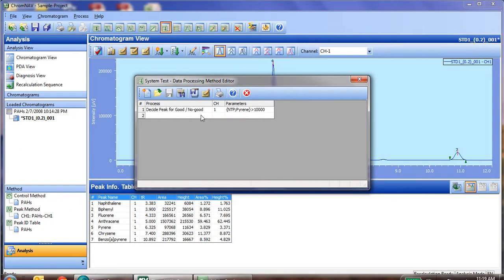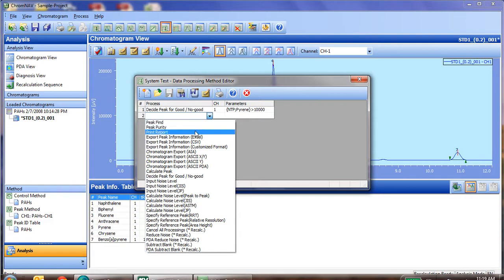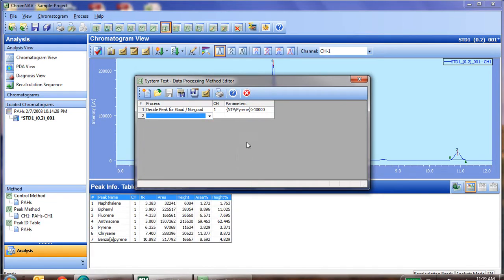Now, of course, if you'd like, in addition to the system test, you could have it print a report, integrate peaks, or do any other kind of export or calculation feature.